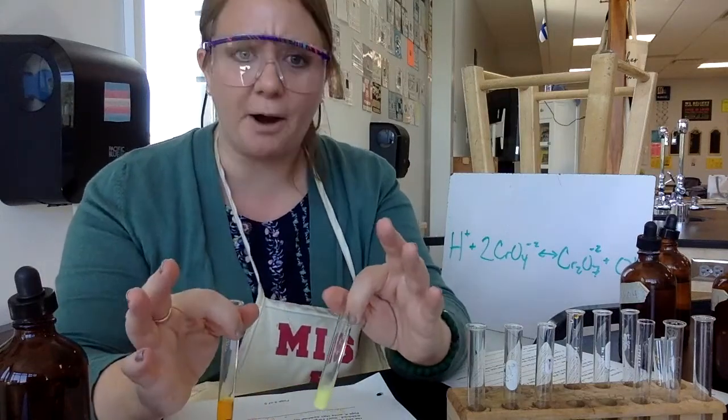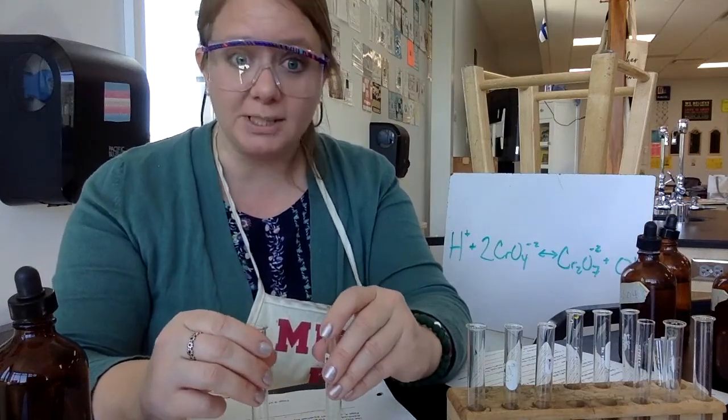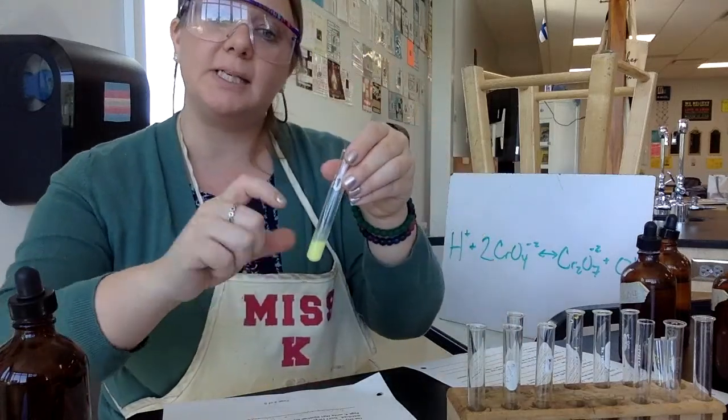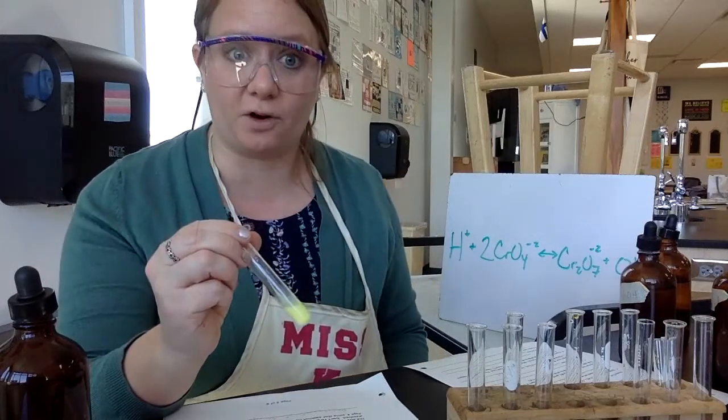Then there's this big paragraph on the bottom of page 3. Here's basically what it's saying. We want to focus on the precipitate because that's the chemistry that happens. Even though this is an equilibrium of the precipitate and the not precipitate, we're going to write the equation as the dissolving version of this.